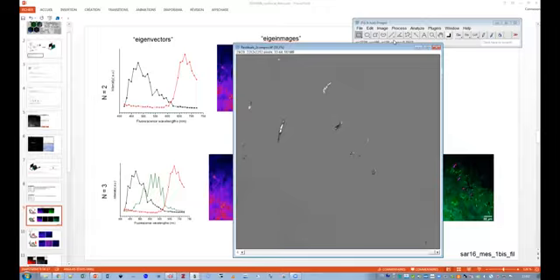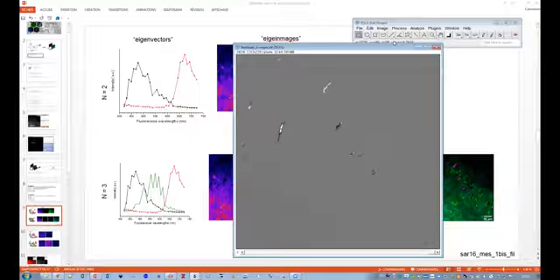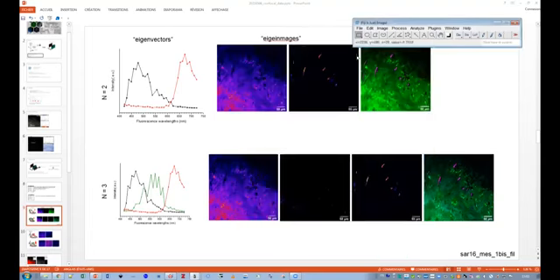Sorry, Juliette. So when, for example, you take like 2 or 3 eigenvalues, does it give you at some point any weight of those? No, I don't have the weight of each eigenvalue. The only thing that I could do is to compare the eigenimages.